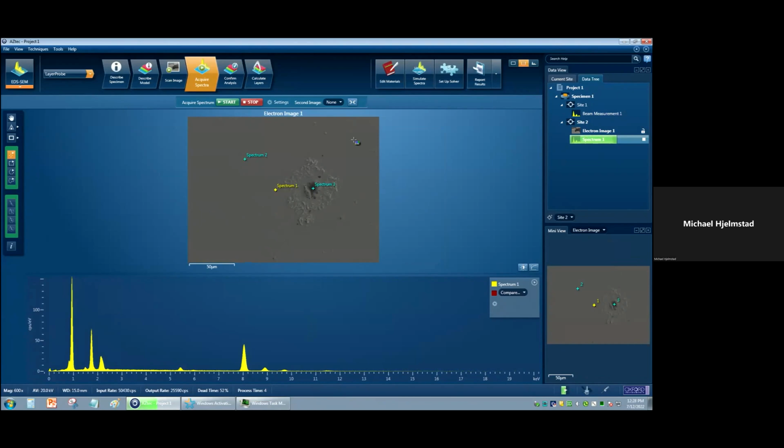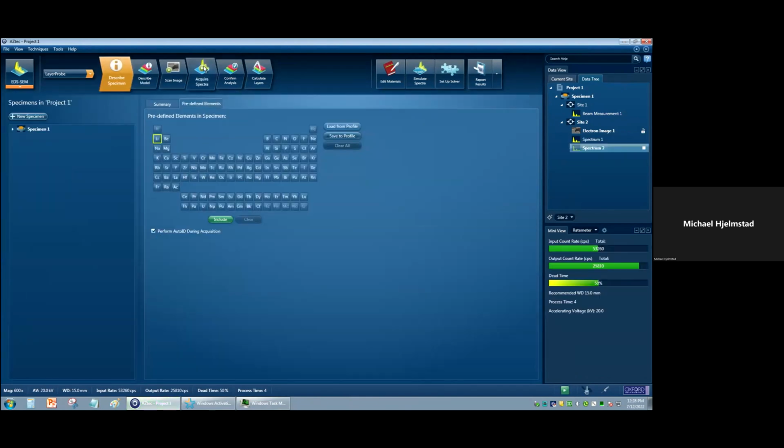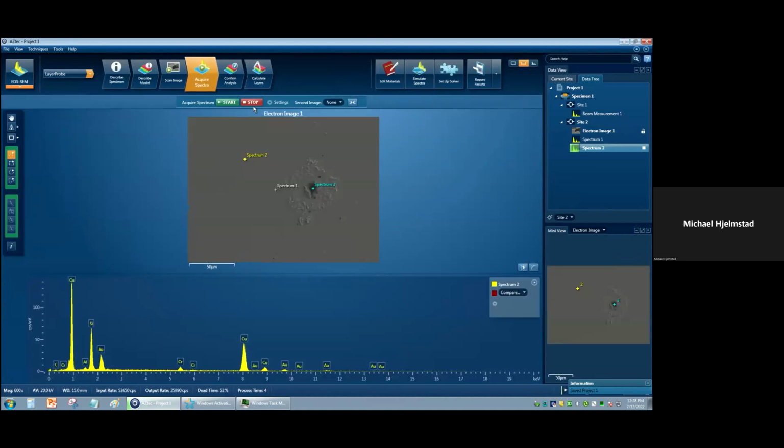And remember, I said 30, 30, 30, and I was expecting, there we go. You can kind of see, I was expecting to see all these materials. I expected to see the chrome. I was not really expecting to see the aluminum, but the silicon and the base substrate, the aluminum, the chromium, the copper. Those were the elements that I expected to see.